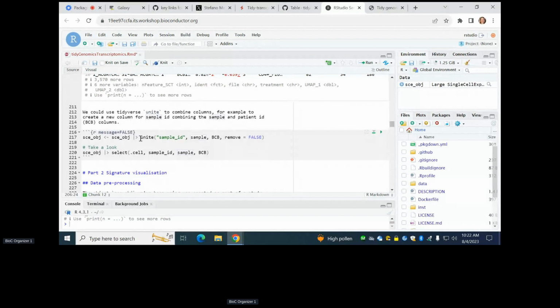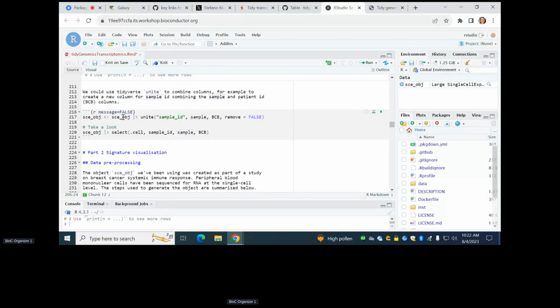So one good thing about this way of doing things is that you don't have to have temporary variables if you don't want to. You save a variable for a reason. It's a big variable, you want to save it or reuse it. But a lot of operations do not require temporary variables. So it's quite elegant in this way as well.